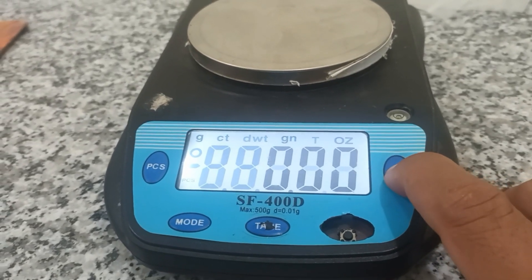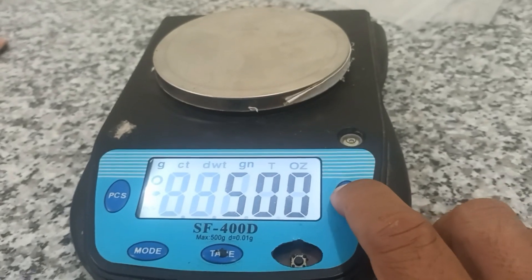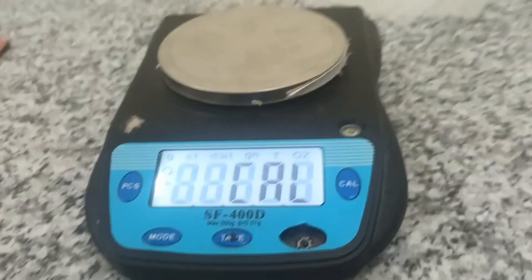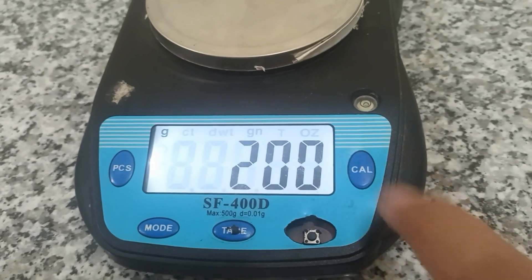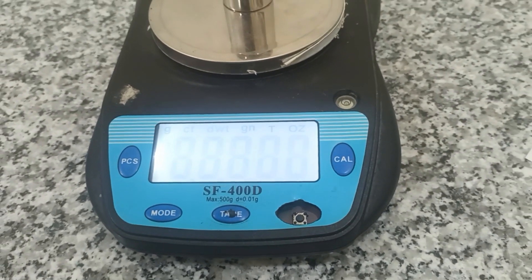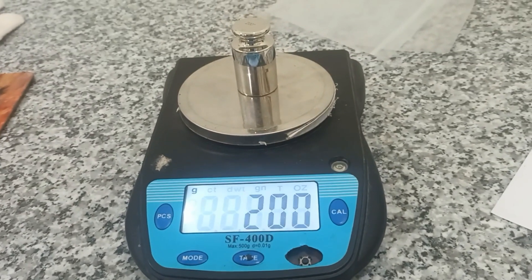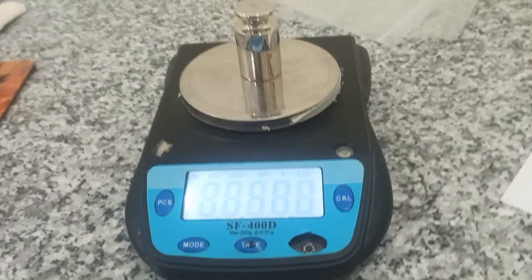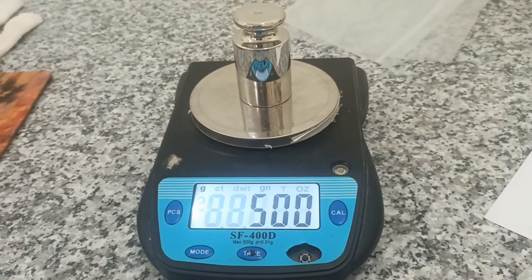Hello everybody. I will adjust the electronic balance. The first step will be to press the key card display. This one is 200 grams — I will put the standard 200 grams. Wait a moment. Okay, and I will add 500 grams. Waiting.